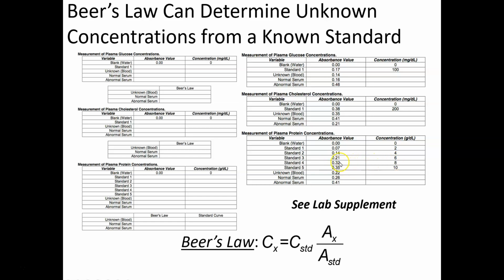So when you look at this data, you think, oh, you know what? 8 is probably an outlier. Something's wrong with 8. Yes, it's theoretically possible that this is the only right one and all the other numbers fall perfectly on a straight line, but not very likely. So I would say, okay, this standard, which should be 0.28 if it follows the pattern, is actually 0.32. I wouldn't use standard 4 because it looks like it's wrong. So why would you use something that's wrong?